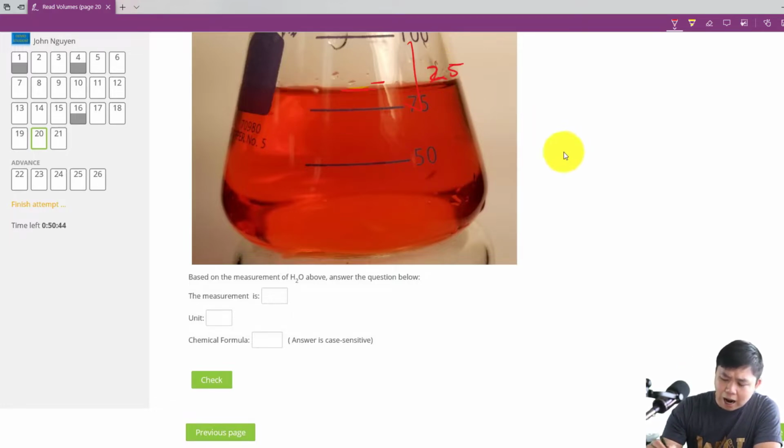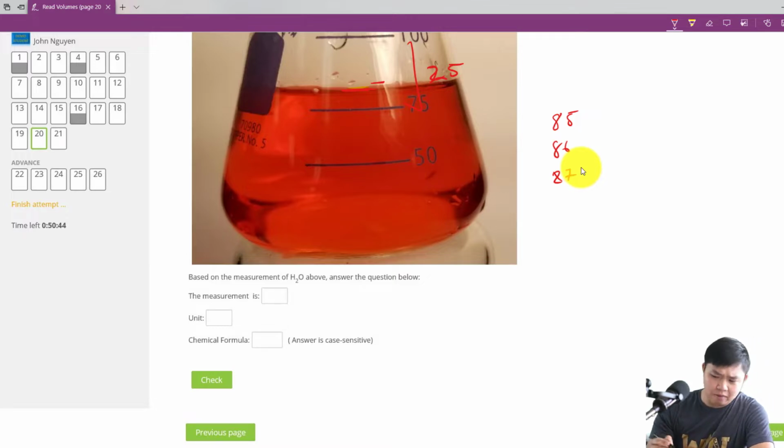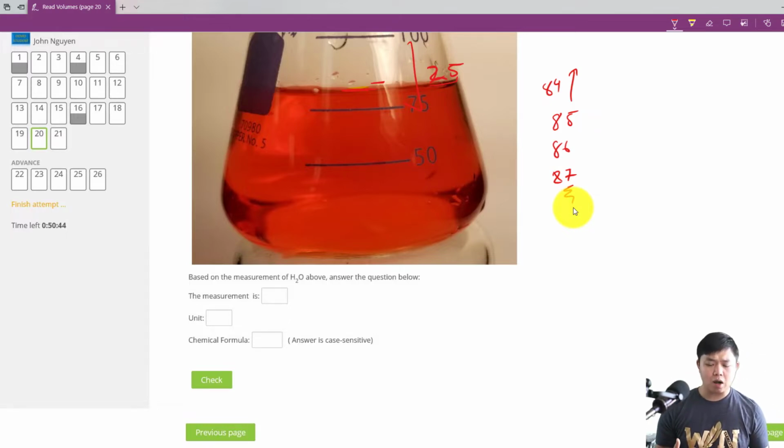So if we look at this, I would assume that this, of course, is not 75, but it should be like, what's this? This is about 1/4 of this, okay? So what we're going to guess is probably 85-ish or 86, 87, and so on, okay? Or even 90 to something. Maybe 90 is a little way up. I would go with the lower end of 84, 83, okay? So your choice in terms of guessing, but you know right away the concept of guessing at the ones place, because this is the 10th place, right? So notice how we play this guessing game. There are multiple correct answers. All those educated guesses are correct answers.